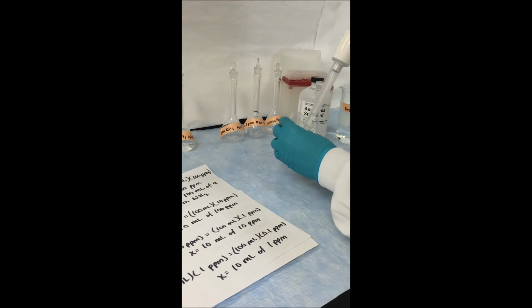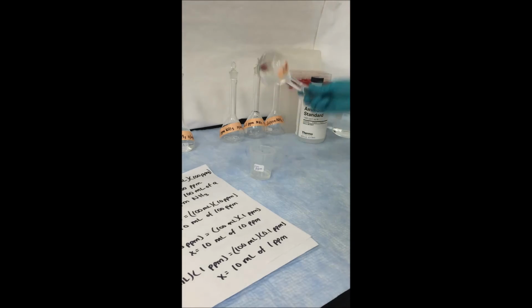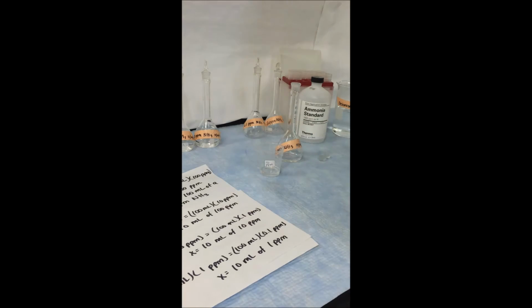Using the good lab practice of maintaining a clean work environment as well as using clean glassware, it will help reduce contamination of your standards and samples. If you were to contaminate your calibration standards, you may get a faulty reading when trying to calibrate your electrode. The more accurate and contamination-free your calibration standards are, the better the data you will get when you perform your calibrations. It is also a good lab practice to record the date that you open your stock solution, as well as record the date you created your calibration serial dilution.